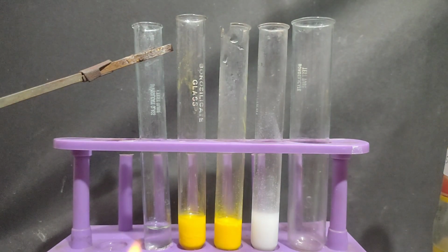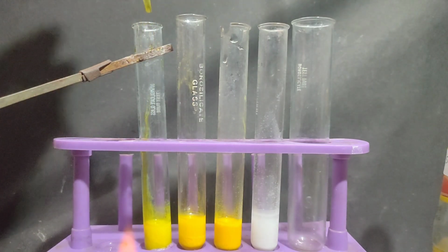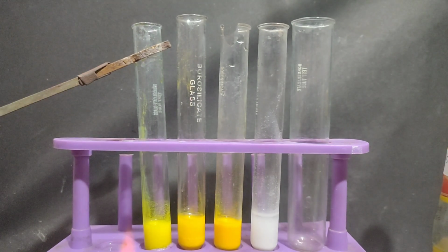Now as I have already shown, on cooling the lead chloride separates out as white crystals. Now I'll be adding potassium dichromate to the leftover solution, and even on adding potassium dichromate solution, a yellow precipitate of lead chromate is formed.